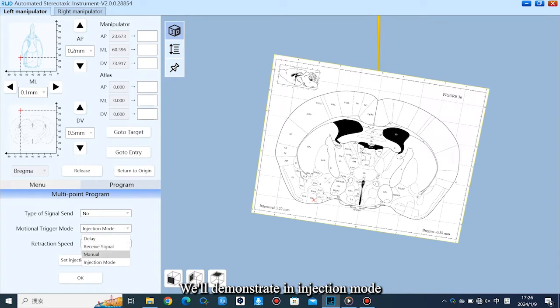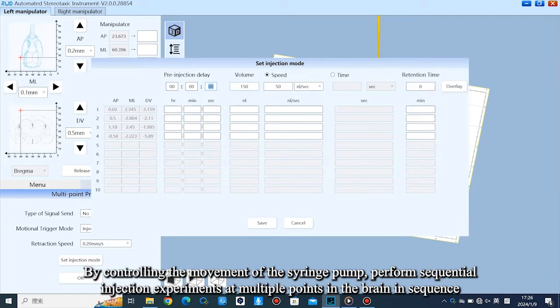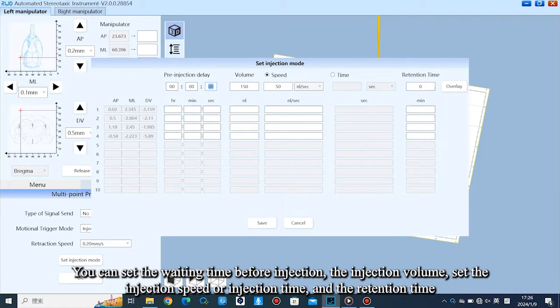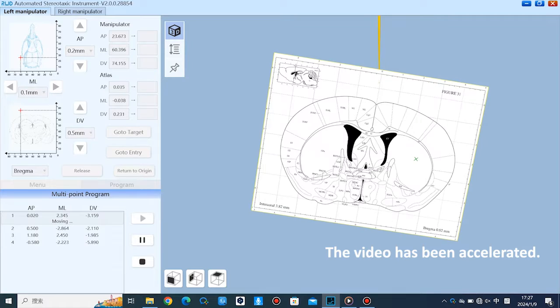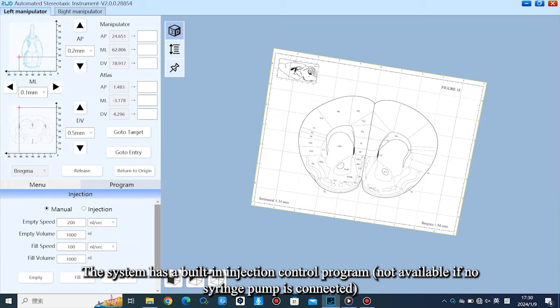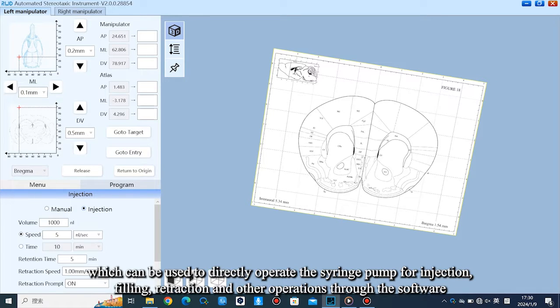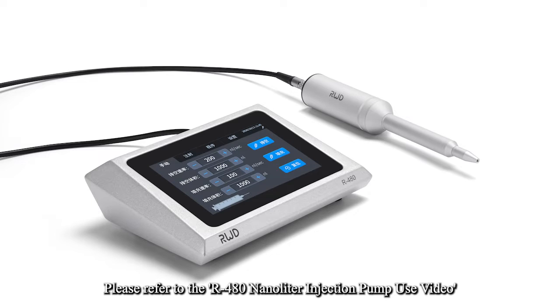In injection mode, by controlling the movement of the syringe pump, the system performs sequential injection experiments at multiple points in the brain. You can set the waiting time before injection, the injection volume, the injection speed or injection time, and the retention time. Parameters can be applied to all points using the overlay button. The system has a built-in injection control program — not available if no syringe pump is connected — which can be used to directly operate the syringe pump for injection, filling, retraction, and other operations through the software. Please refer to the R480 nanoliter injection pump use video.